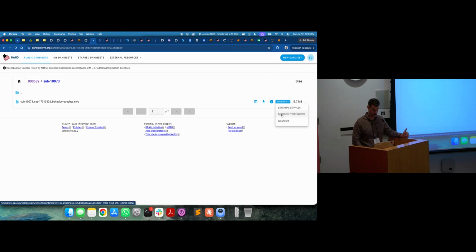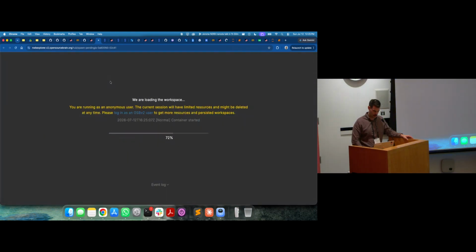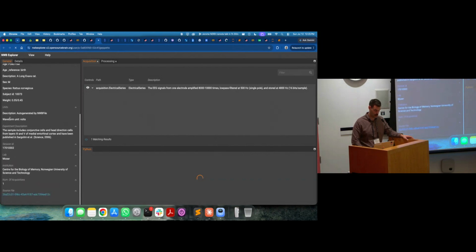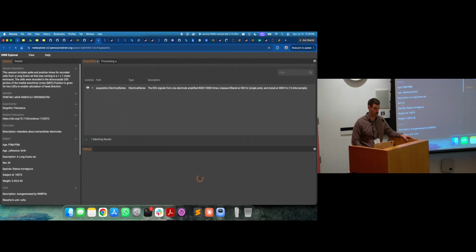Metacell is a company that developed NWB Explorer. I haven't used it in a long time, but they also provide some interactive visualizations. It's not something that I actively work on, but I know that they really leaned into intracellular electrophysiology visualizations, so that might actually be really useful to check out here. But you can already see some similarities in the way that they're displaying the metadata of the data set.